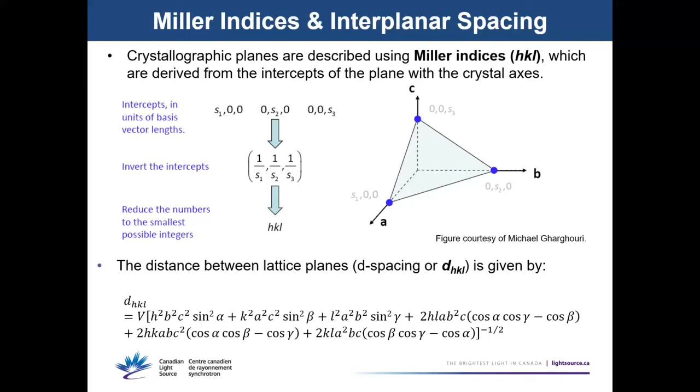And there are numerous software programs and apps where you can input a unit cell and a wavelength to generate a possible list of Bragg reflections for your material.